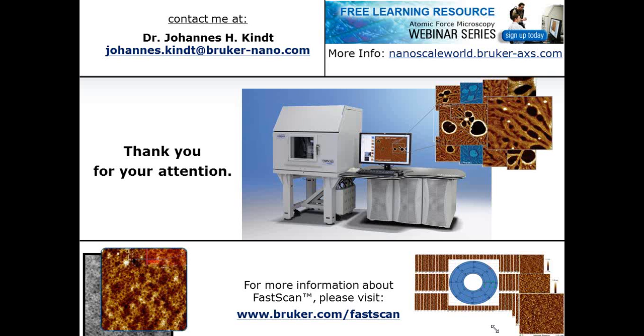Okay. So I think the short answer is yes. From a certain amount of roughness on, there is definitely a contribution of that, and one has to be aware of it. Where that would come from is basically a change of the contact area between the cantilever tip and the sample. The cantilever tip has a certain tip angle, and as soon as you have components that are even approaching that, you start having some level of side contact, and so you exaggerate your stiffness and probably some of the other components simply by the fact that you're not imaging with a hemisphere anymore, but you start imaging with a cone. So one has to be aware of that when making quantitative claims, definitely.